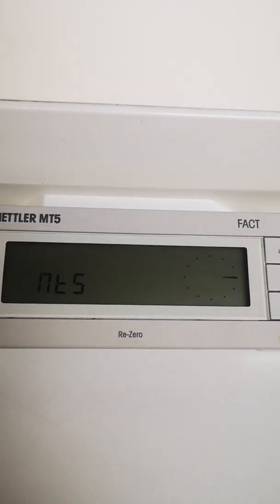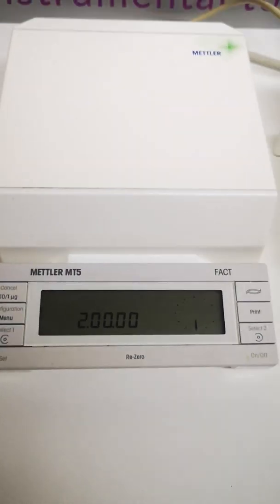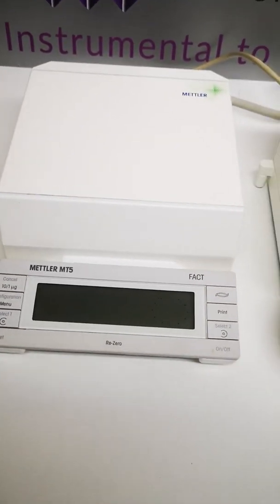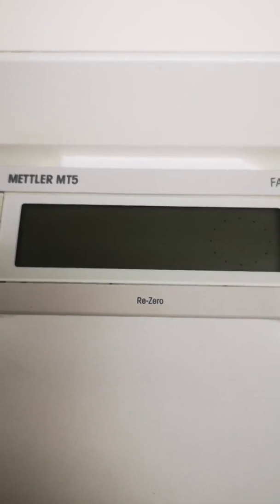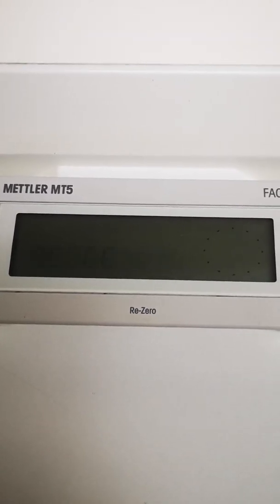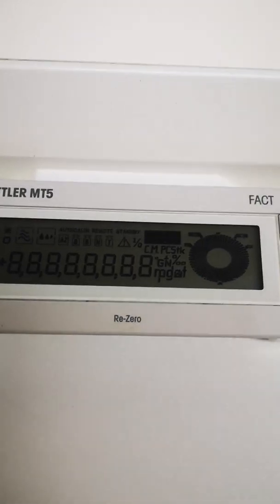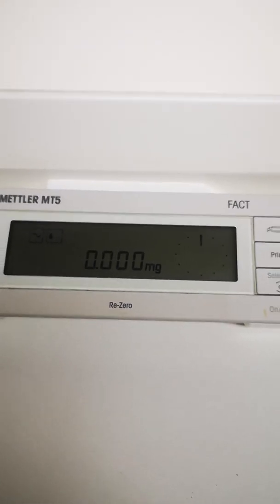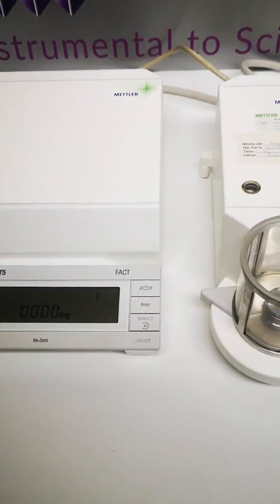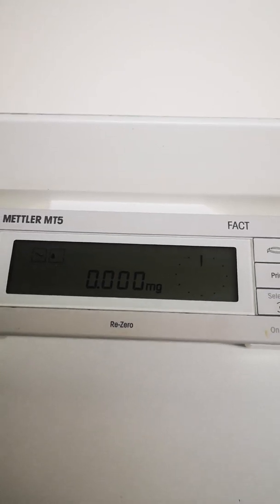We're on a sprung floor here — we're up on a mezzanine and it's not damped — so please bear that in mind. It's going through its self-test now. Hopefully you can hear it move. You can see the sample compartment moving as it goes through a series of different stages.